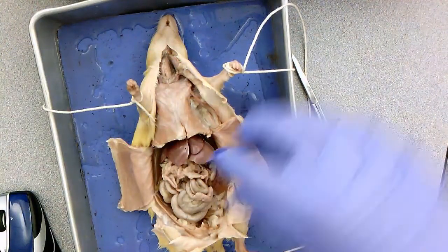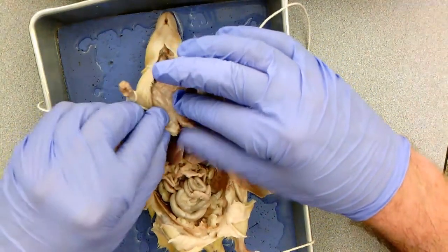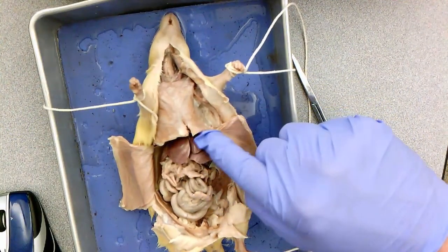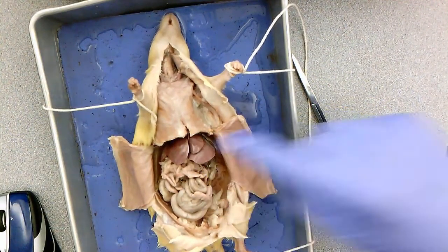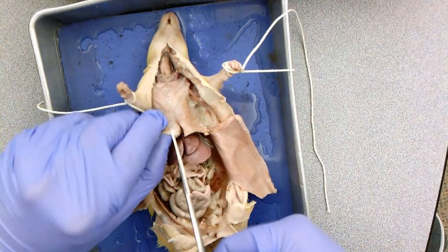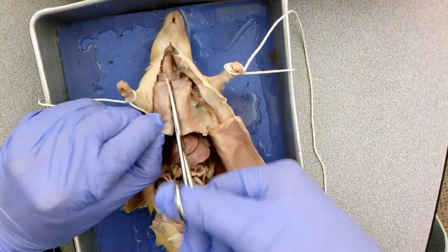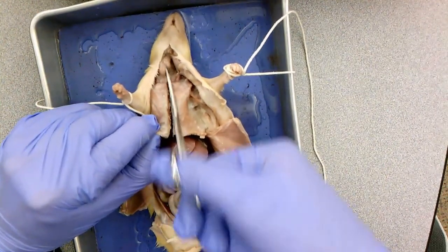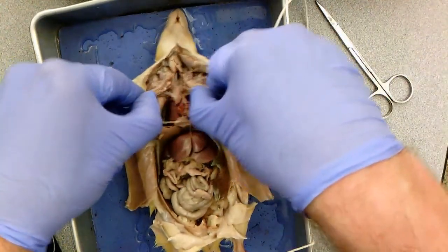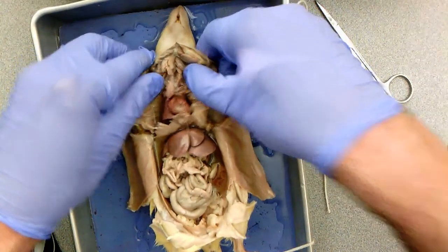What separates the abdominal pelvic cavity from the thoracic cavity is a muscle that's hanging out right here. It's called the diaphragm. It's a muscle that aids in breathing. This is a little bit more difficult to get into the thoracic cavity. You have to cut up the sternum. So I'm just going to cut up here with scissors all the way up the sternum. That's right here. And I'm then going to open that up really, really good.